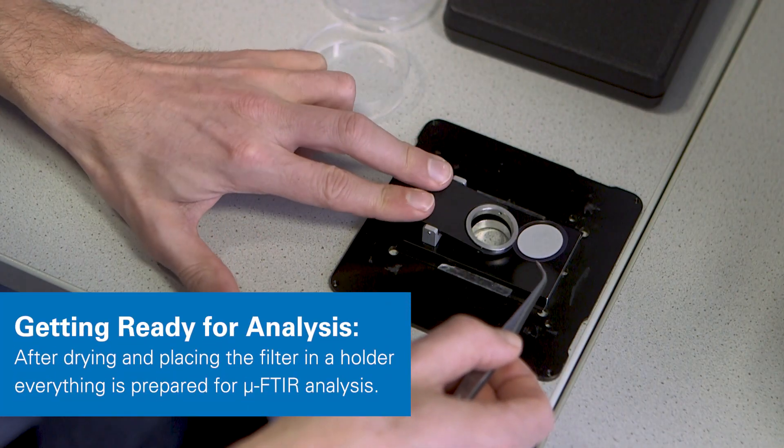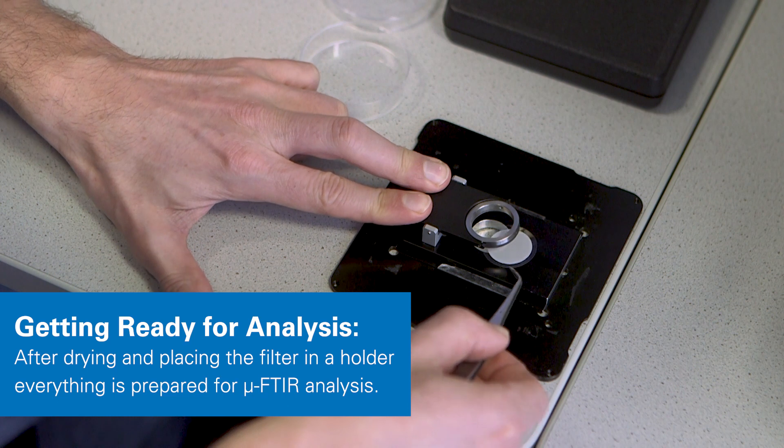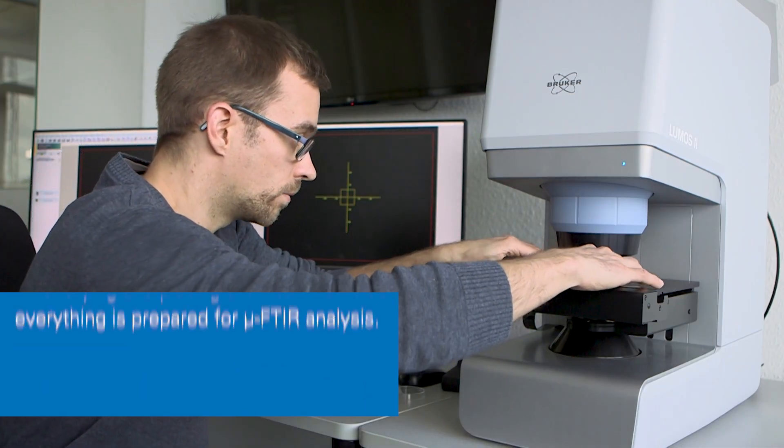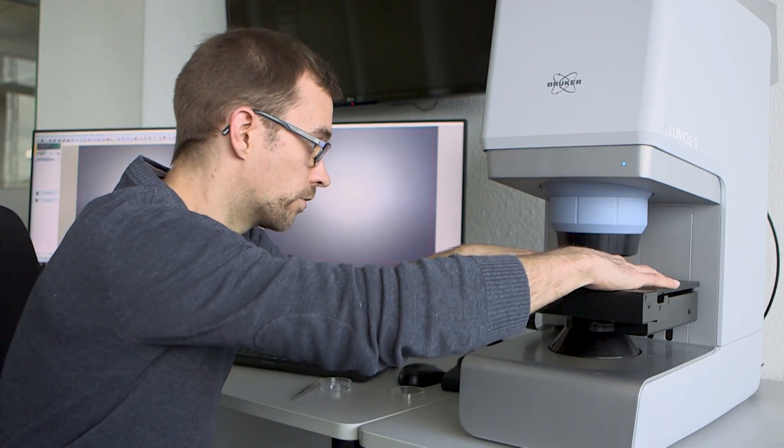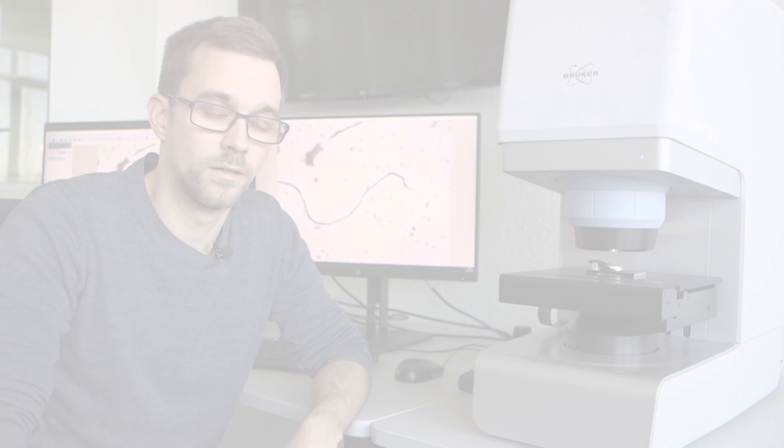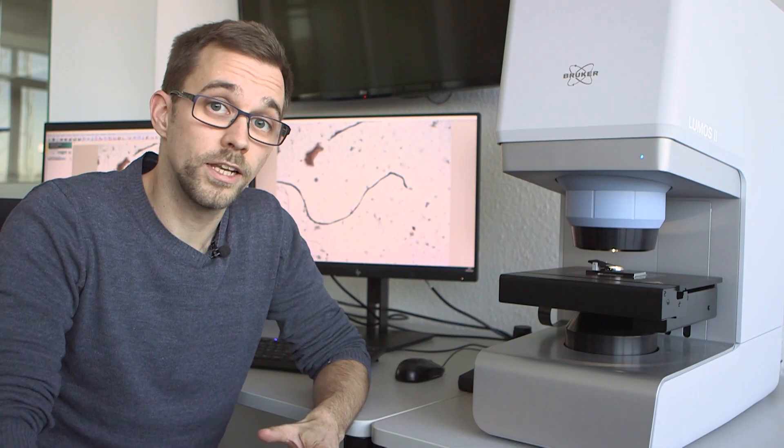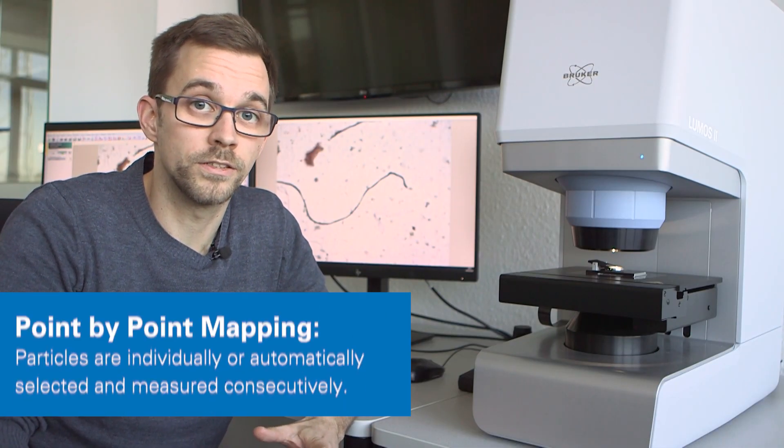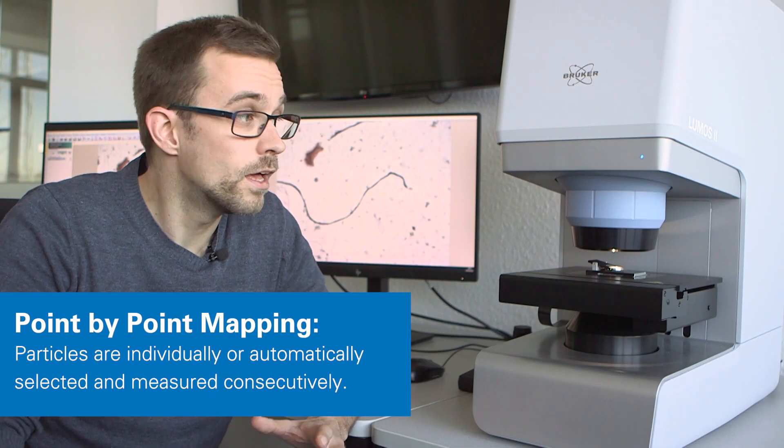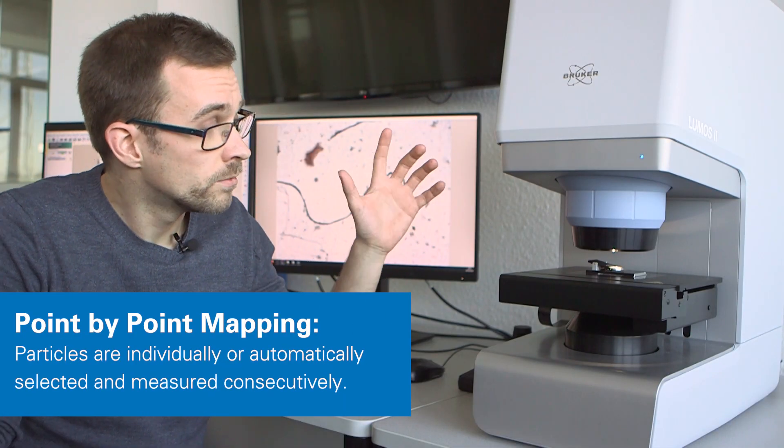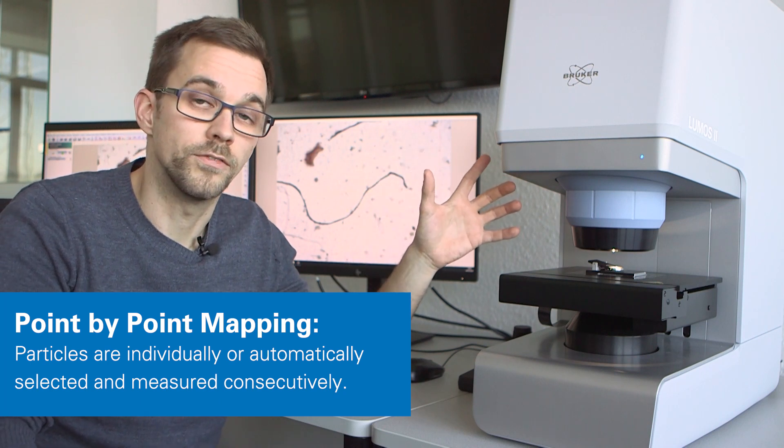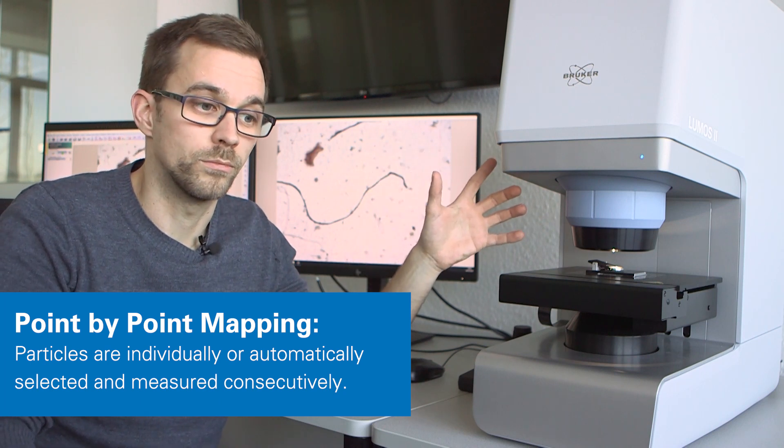For the analysis, the filter was placed in a filter holder and onto the microscopy stage. We are now ready for the single point mapping analysis of our sample that has already been put on the stage of the Lumos II FTIR microscope.